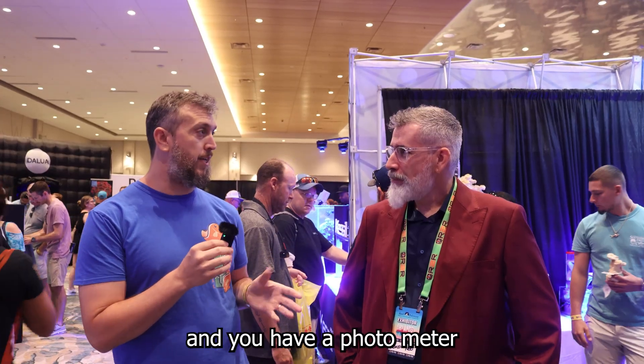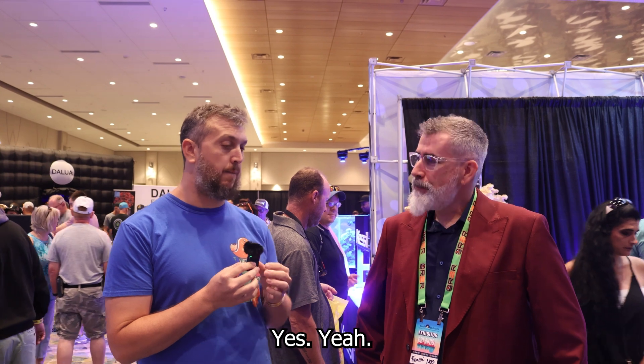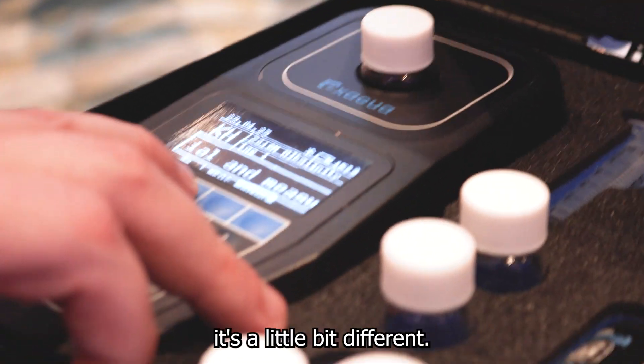We're here at X-Aqua and you have a photometer testing your reef aquarium. It's a little different way of going about testing.